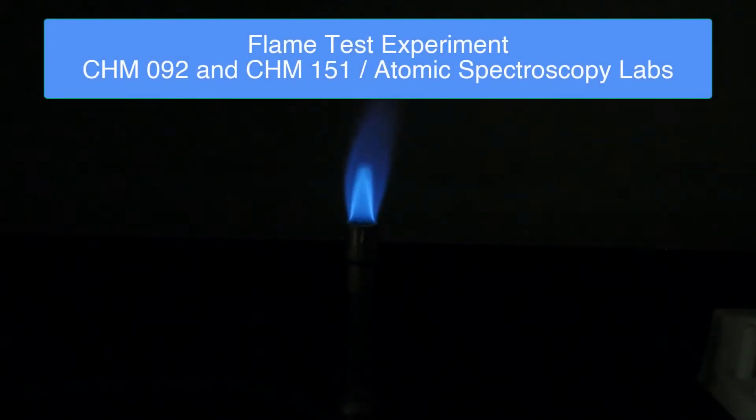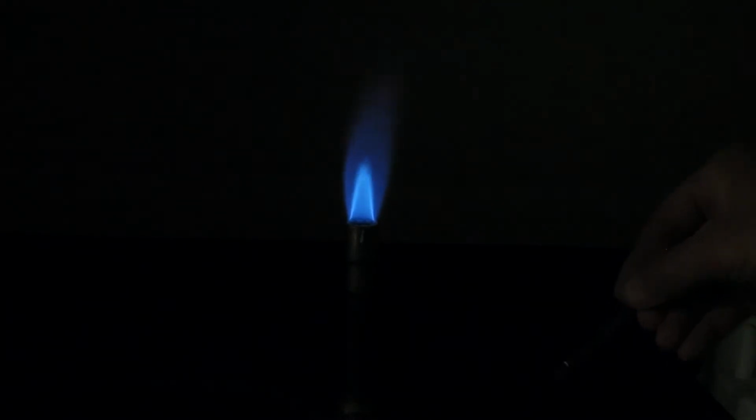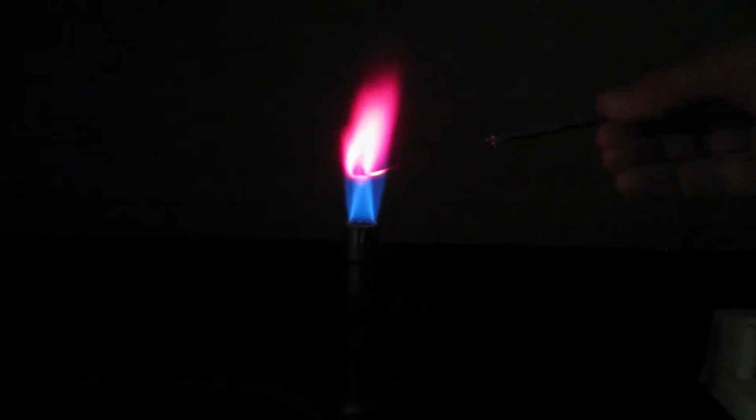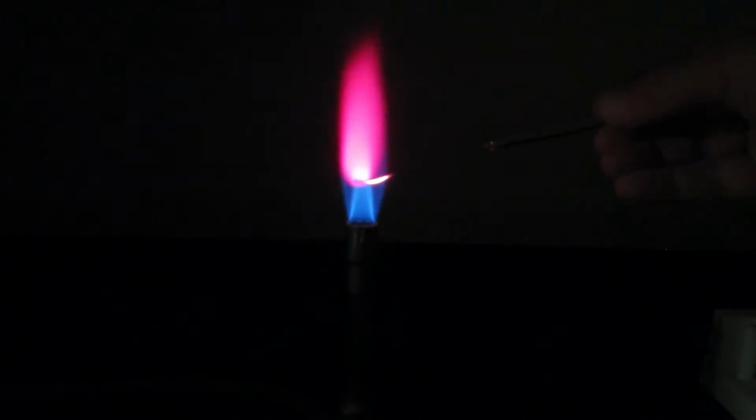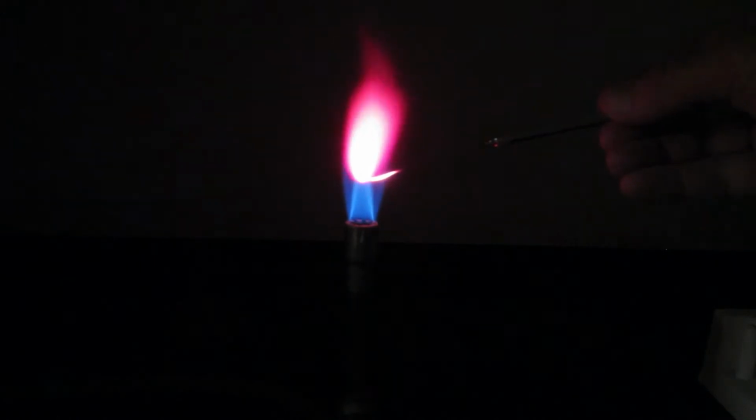Now what you're going to see in this video are about 7 flame tests of known salts. For example, this first one is lithium chloride. And I'll describe what's happening in just a second. What you want to do is record that color that you see there. Okay, so that bright red color is indicative of lithium in a sample.